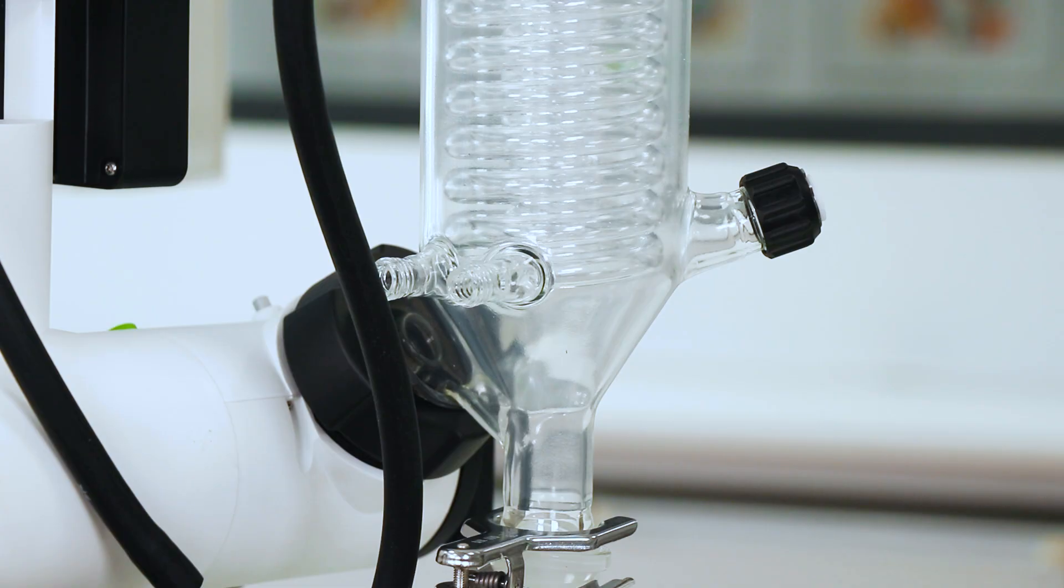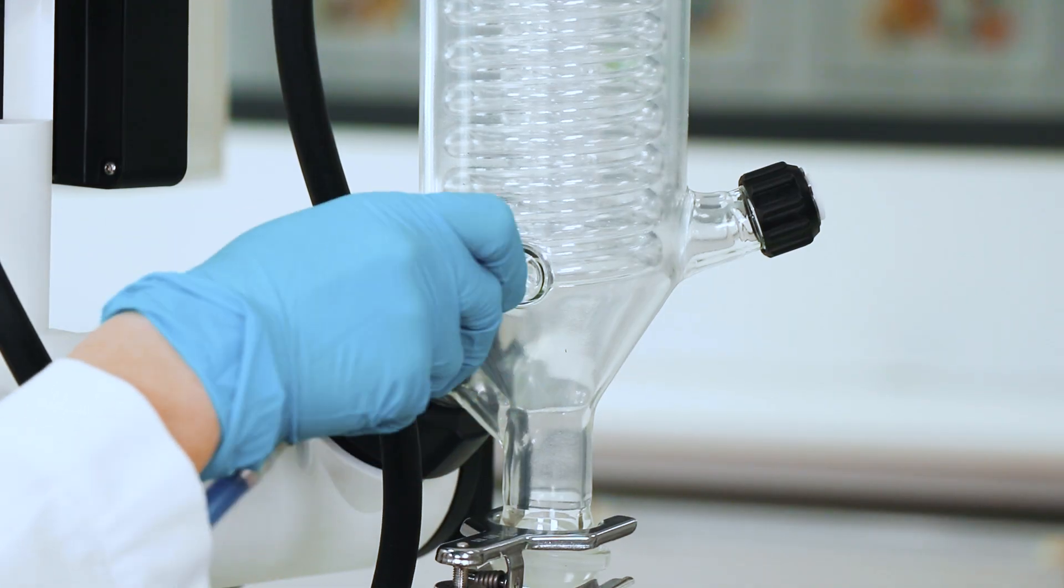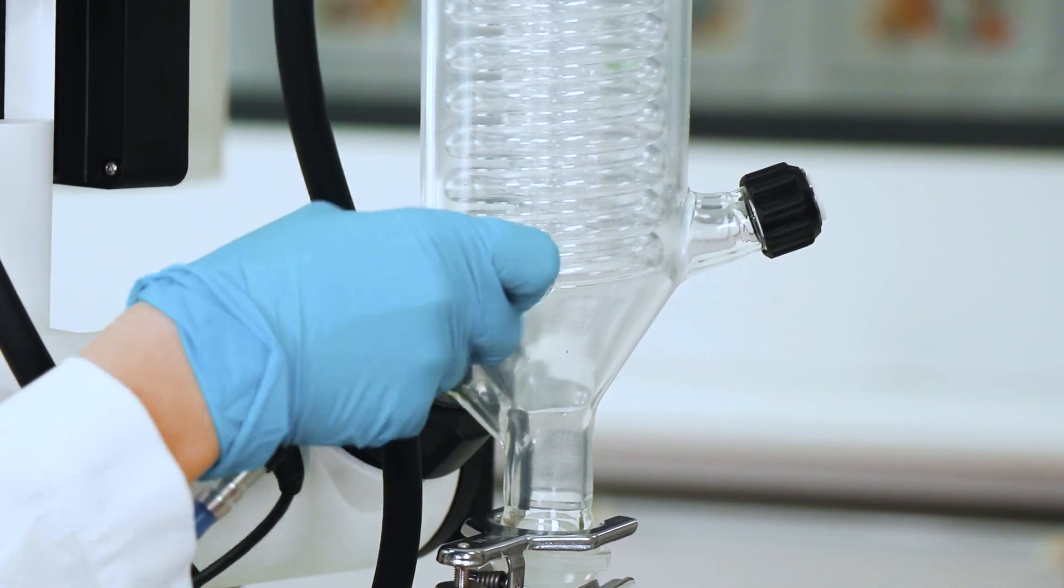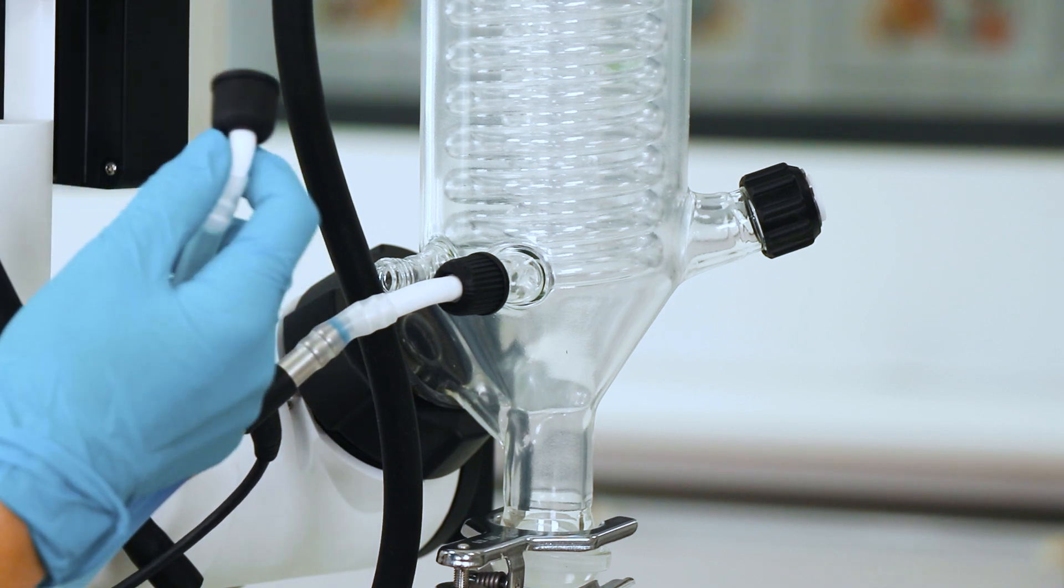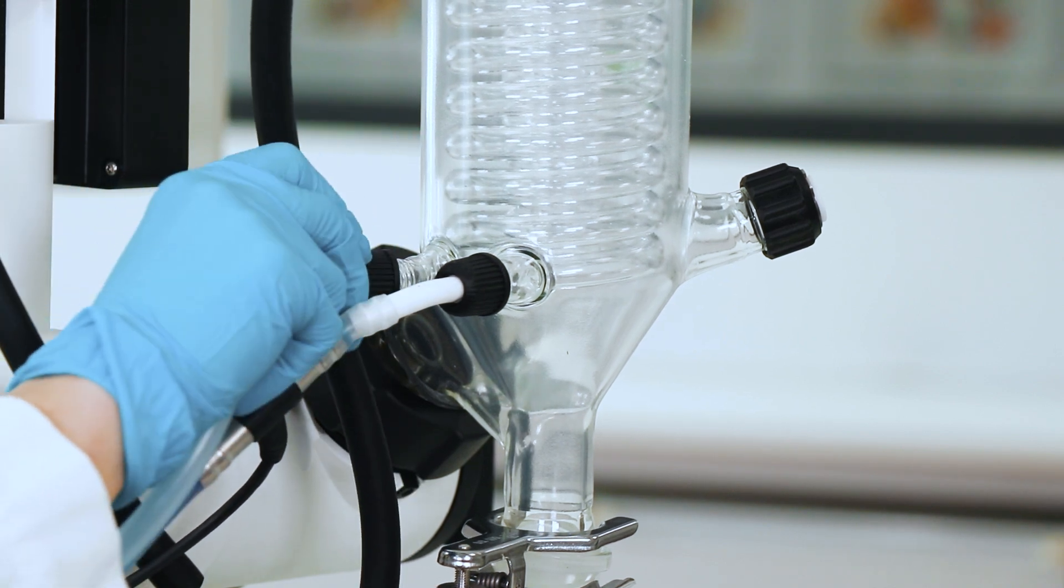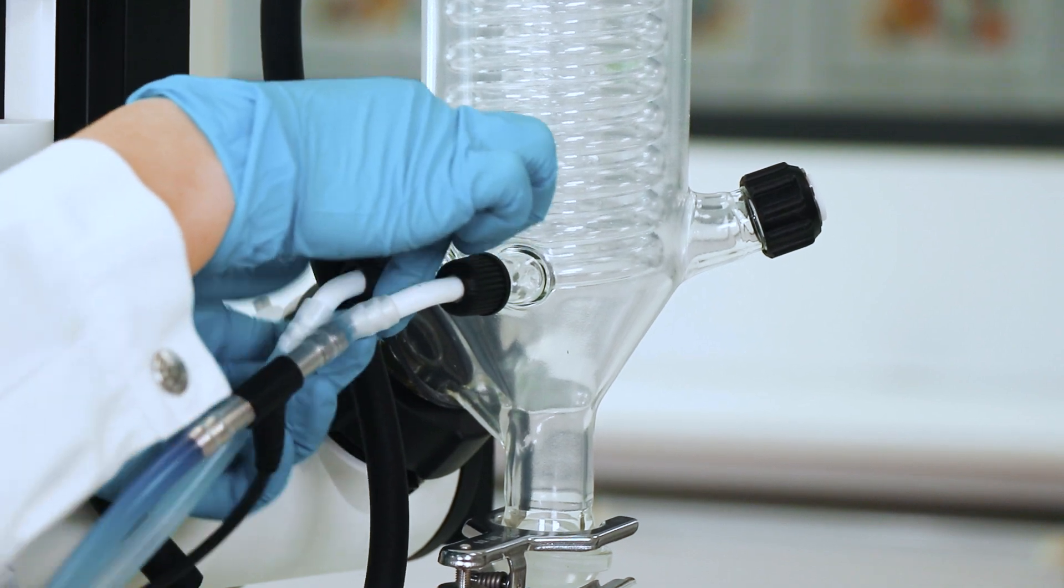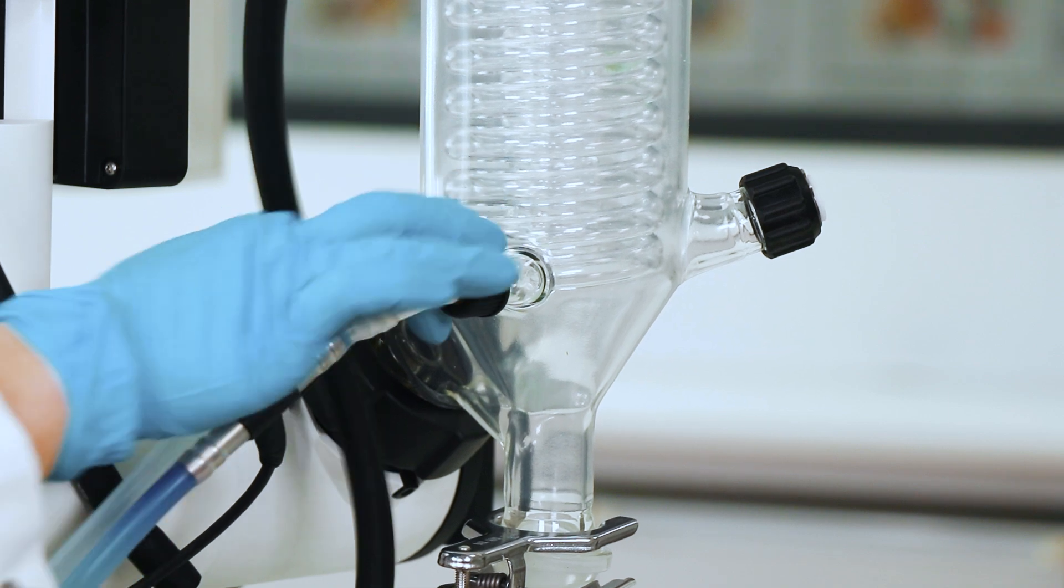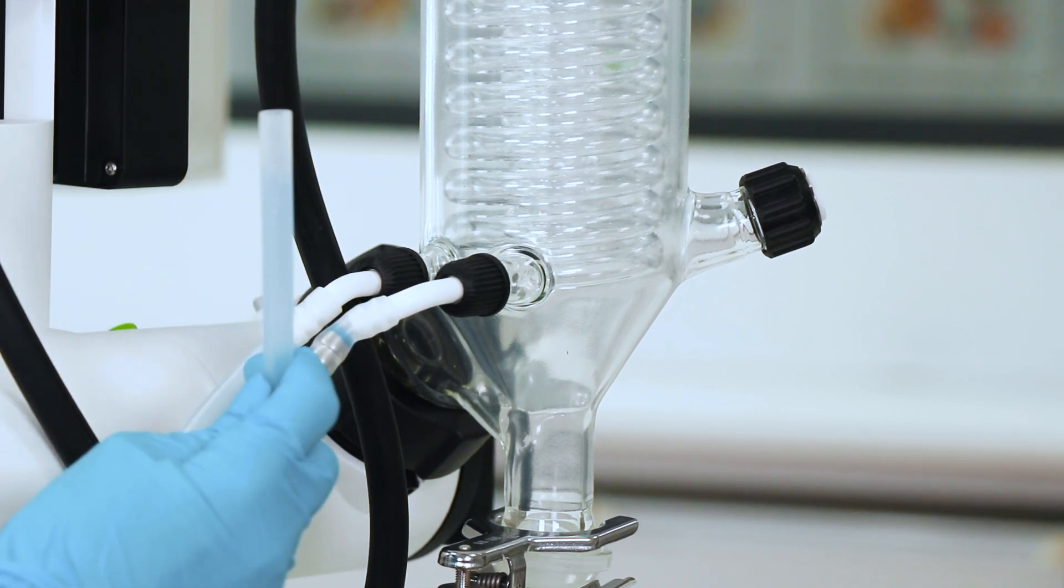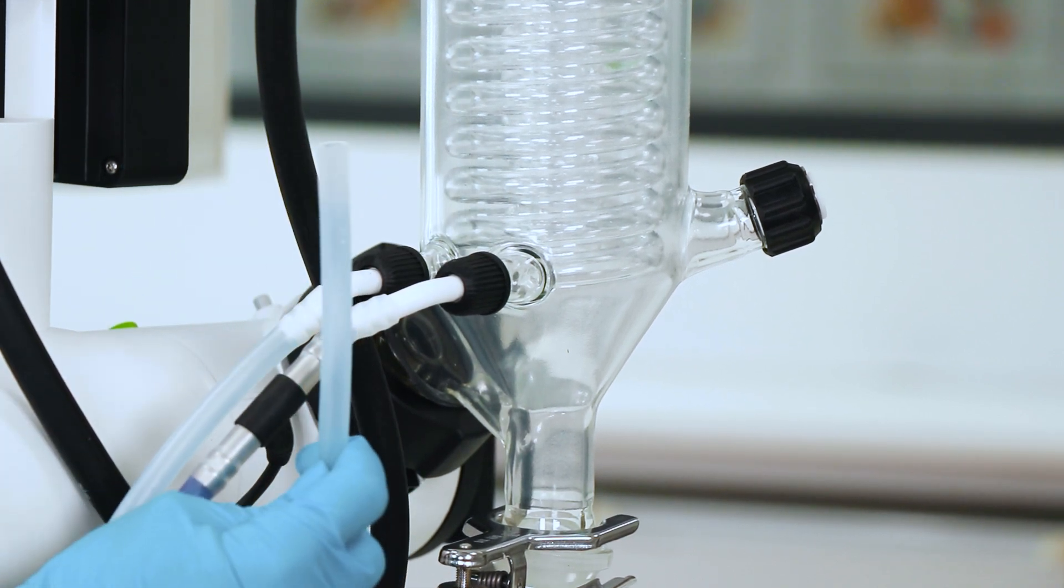So then you take the same tube and you connect it to one of the outlets here. And you take a second tube that's also connected to a nipple and connected to the other one. And the end of this tube, you can just connect to your water outlet.